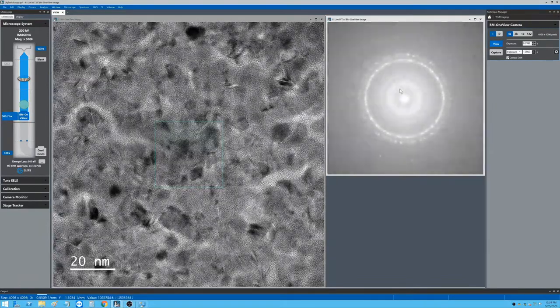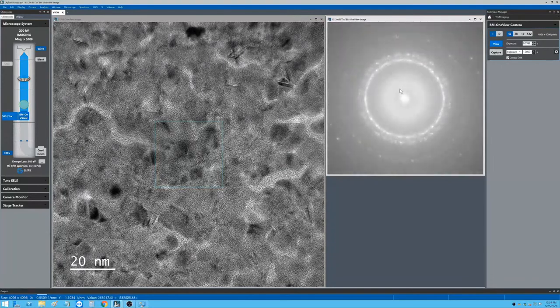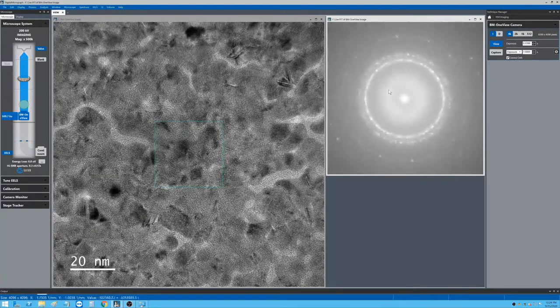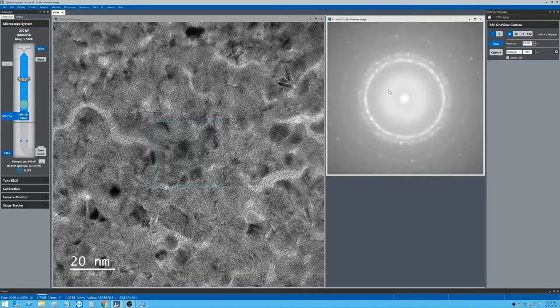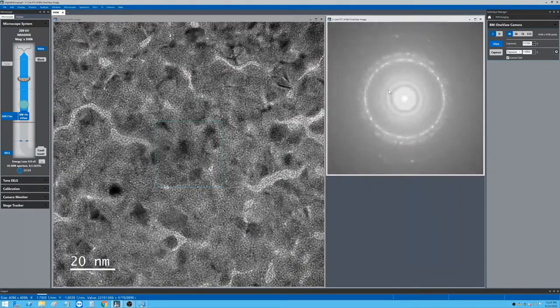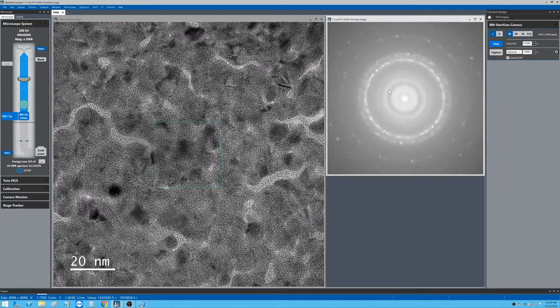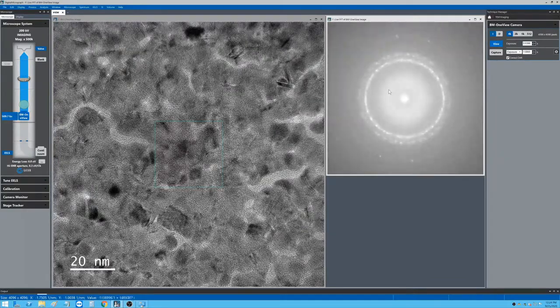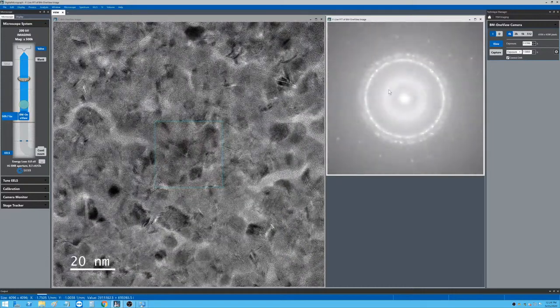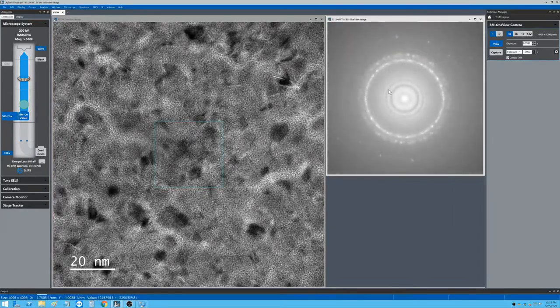And apparently, like here, there are no rings showing anymore, except these rings. And from here, if I change the focus counterclockwise, I can make the rings show up again. So now I'm going back to clockwise. Now the rings have all disappeared. If I continue to change the knob clockwise, now they are showing up again.